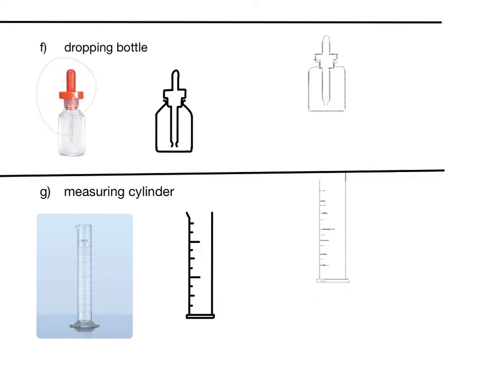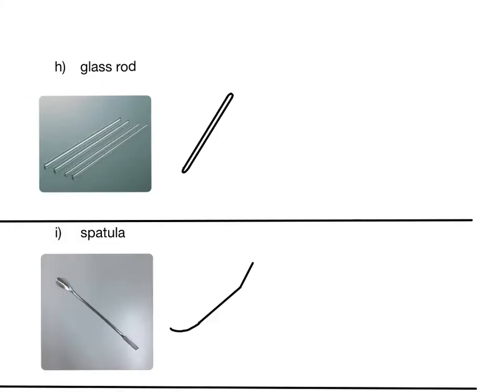Final part. Okay, and the remaining ones are easy, the glass rods.